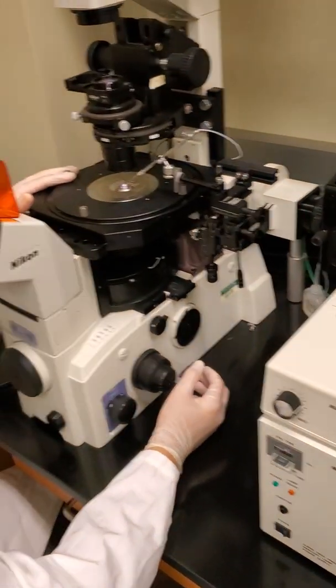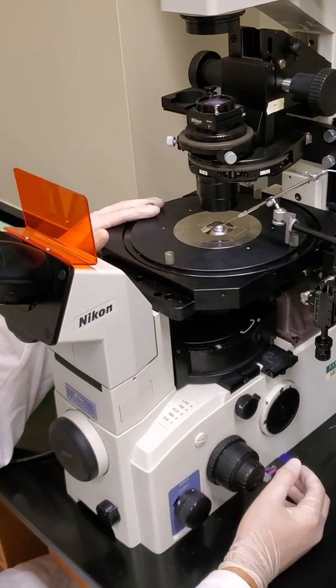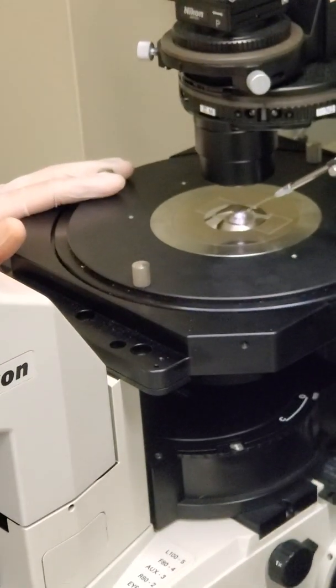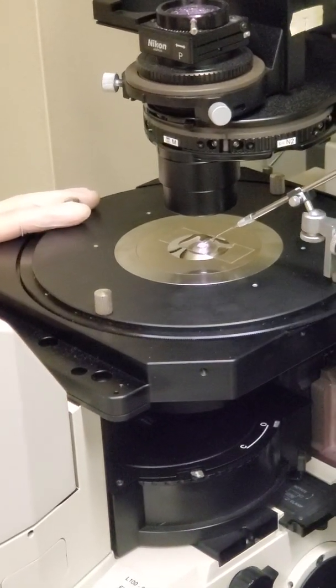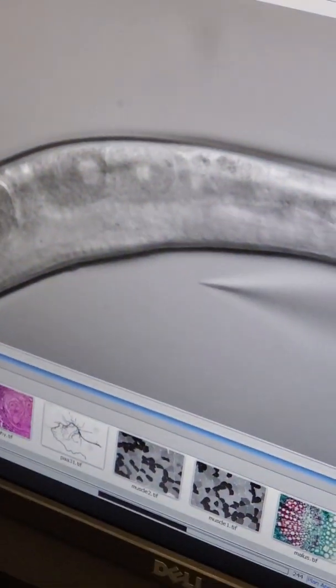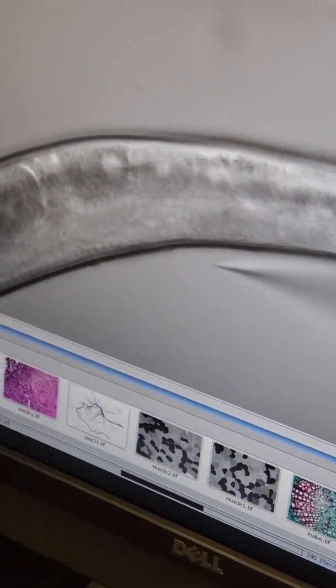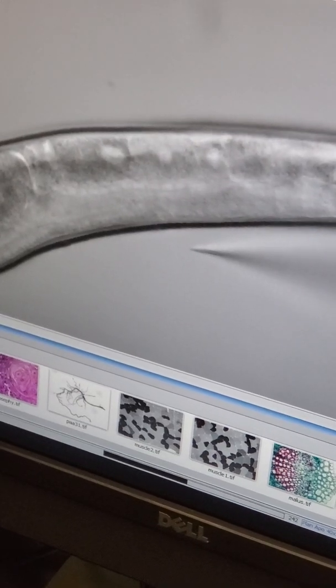And so we're not actually moving the slide or the needle at this point. What Josh is going to move is the stand itself. So he's got his fingers on the knobs there. And this whole stand will slide. So that's the easiest way to control it. If you move the needle at this point to try to put it into the worm, you're going to break the needle because you're going to move it too quickly.